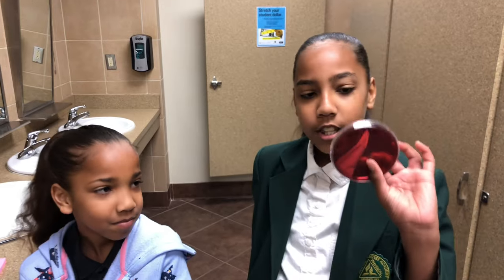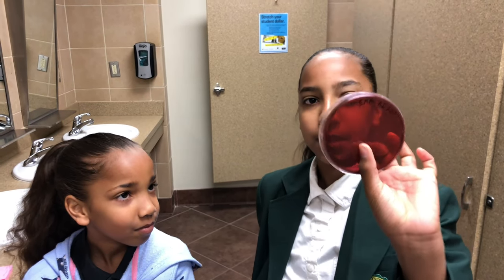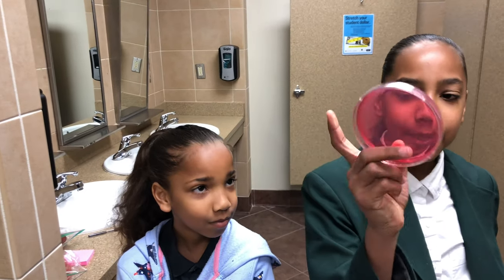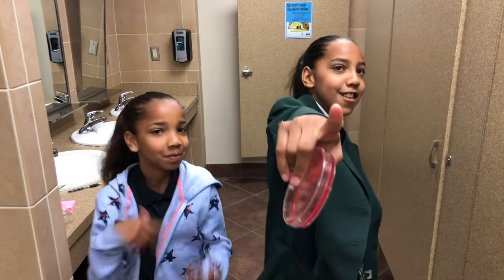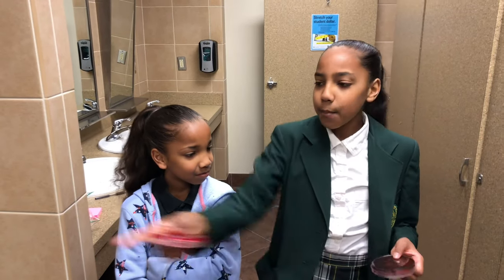Hey guys, it's Jasmine and Janiyah and we're back with another video. We read articles that hand blowers in bathrooms blow out fecal bacteria, so we're gonna test it out. We have this plate right here to test for that — it's called an EMB plate — and we're also going to be testing for staph, so we have this plate.